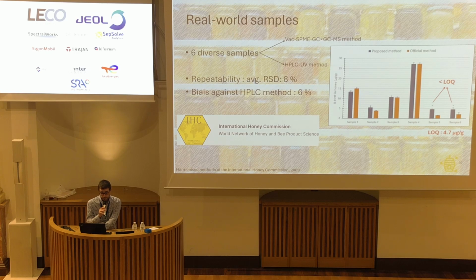So what we can observe from the comparison here is that we are in agreement with the official method. There are just two samples that are not in agreement, but they are below the LOQ, which is already far below, 3 times below, the limits asked by the legislation.